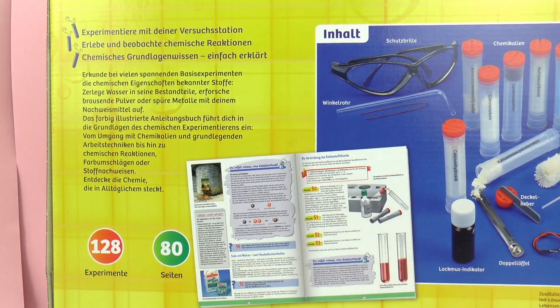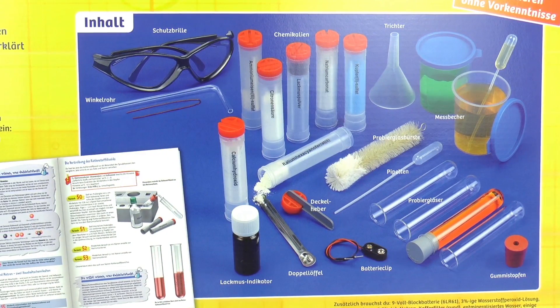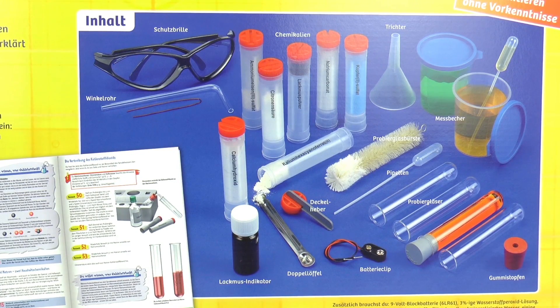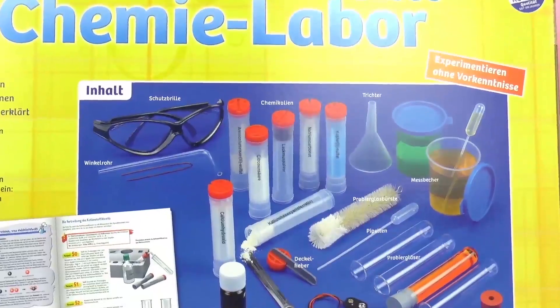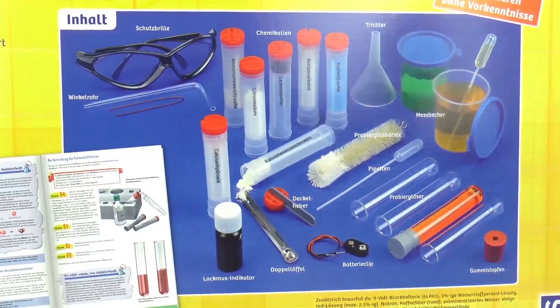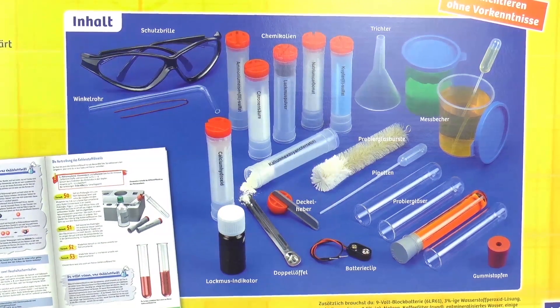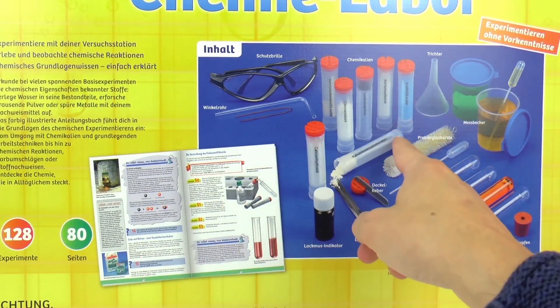It looks like there's also plenty of materials included — everything that we're going to need to be able to do these experiments. It looks like there's some safety goggles, different chemicals, perhaps some test tubes and an eyedropper. In short, everything that we're going to need to do 128 easy chem experiments. And you don't need any experience in science or chemistry to be able to do these experiments. Everything will be explained in the book — it's all self-explanatory and will help you learn a lot, but it's also going to be a lot of fun.